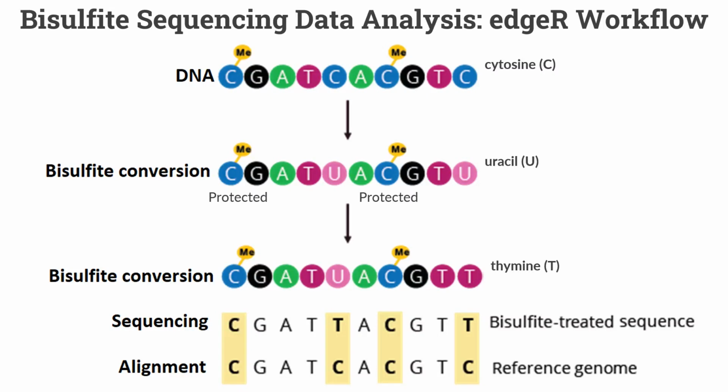Hello, everyone. Welcome to my video tutorial for bisulfite sequencing data analysis. There are other methods to analyze bisulfite sequencing data. Today, in my demonstration, I'm going to show you the edgeR workflow.